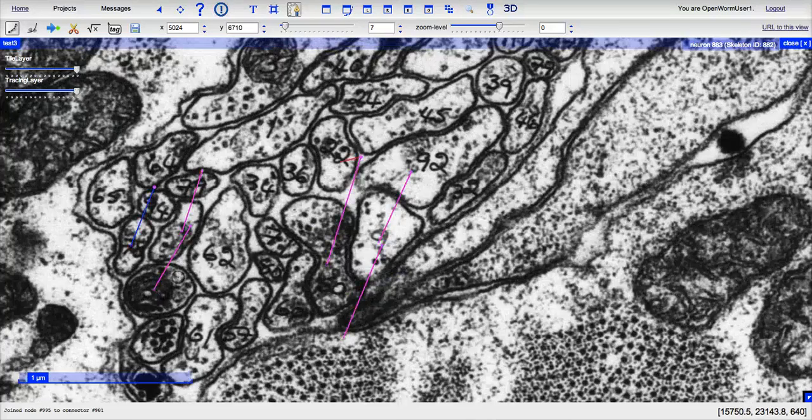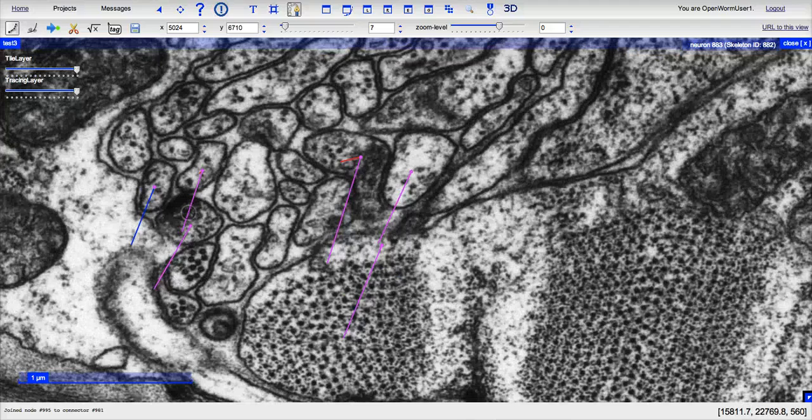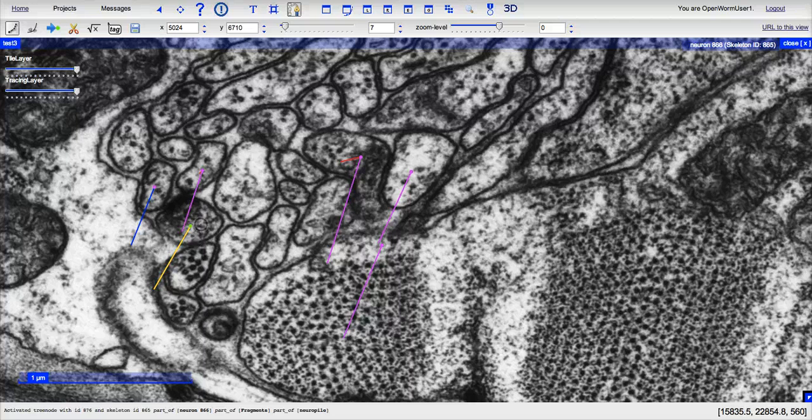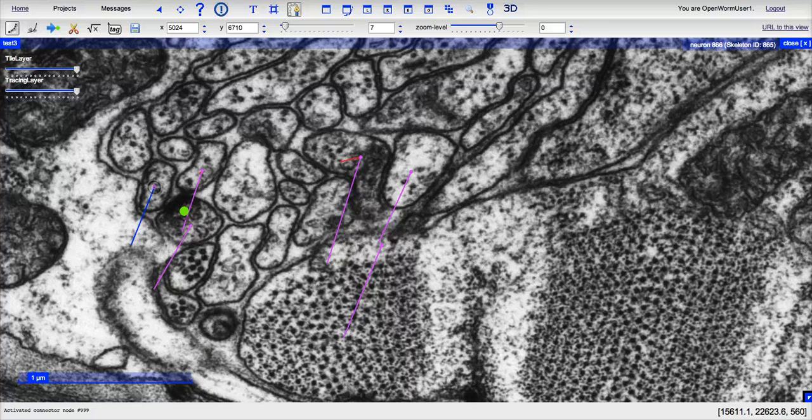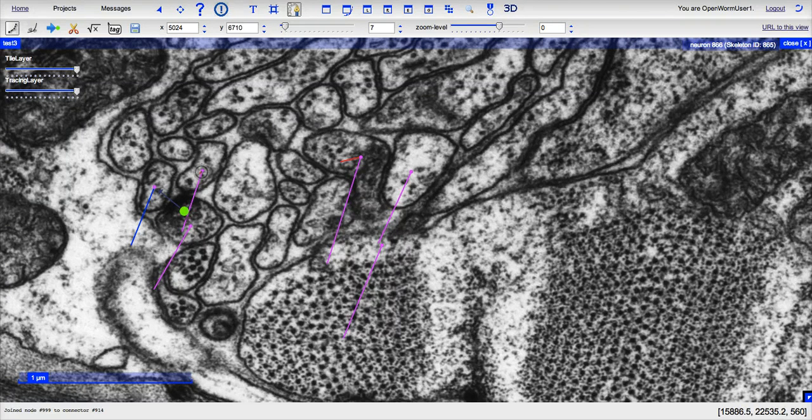Again, you can see this other synapse that we marked before. I will click on this node to make it active, shift to click where I believe the presynaptic cell is, and for both the postsynaptic partners.